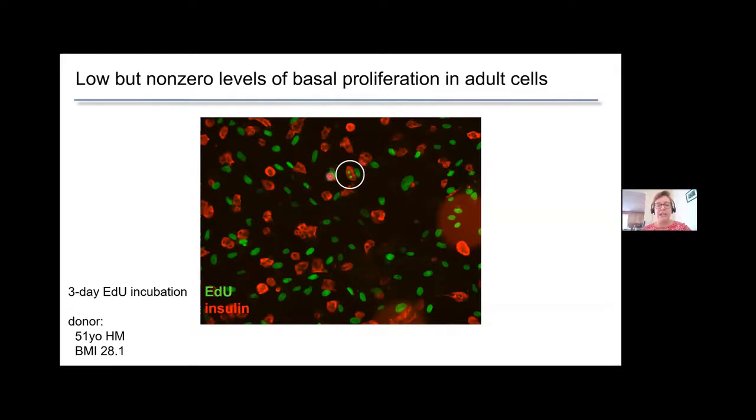And circled here is an example of exactly what we're looking for, with red cytoplasm surrounding a green nucleus. These other cells are the ones I'm talking about that kind of overwhelm the culture. And fortunately, with our image analysis, we can filter those out because they would just introduce far too much noise otherwise into our system.